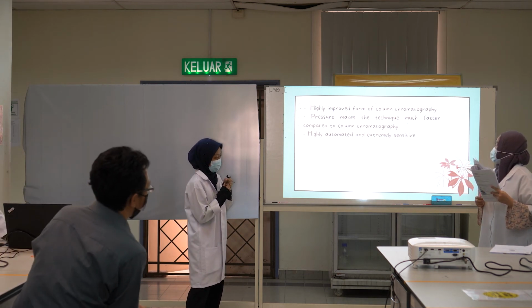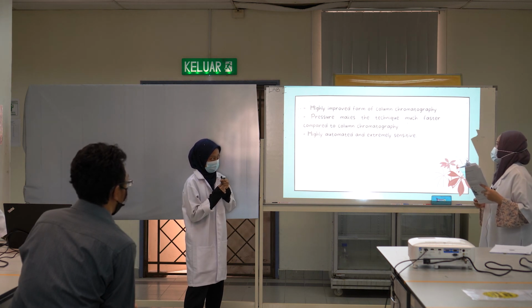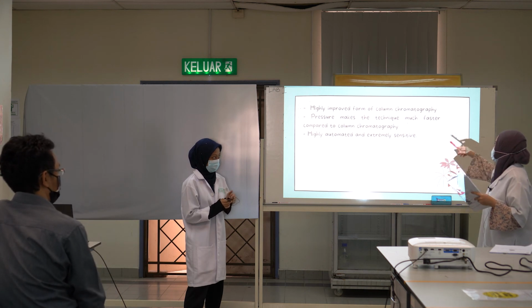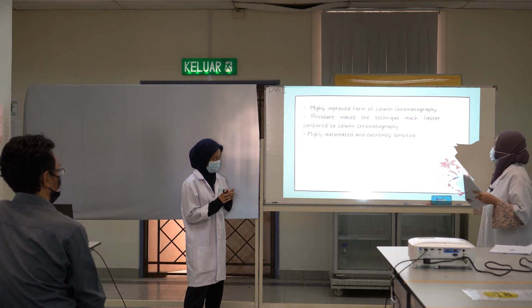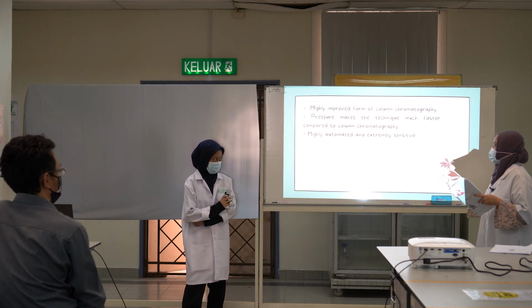In terms of the technology, HPLC is more advanced compared to column chromatography.